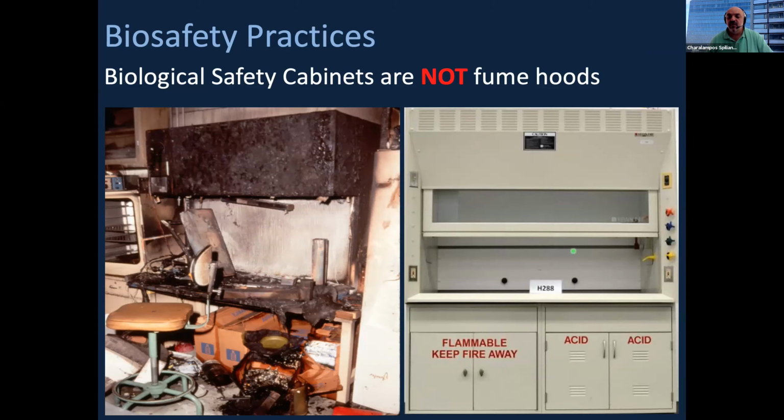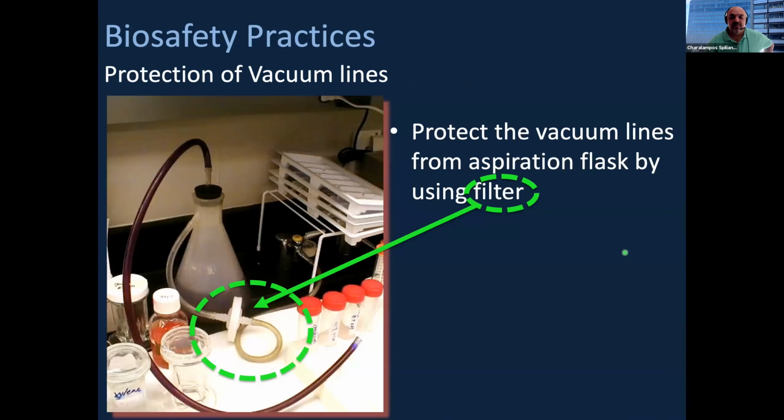The designated fume hoods are within our labs, and they do have pumps actually taking out all the fumes. So we have to be careful because certain accidents can happen if we don't properly store the material we have, such as flammable material, in the designated hoods.